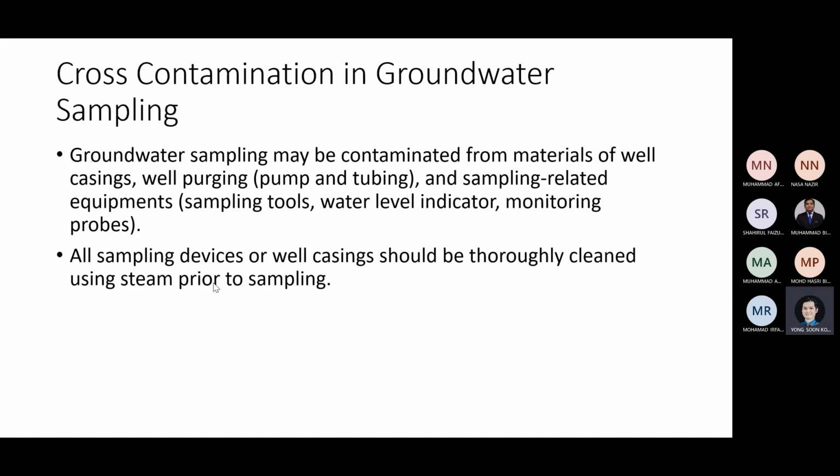Okay, so cross contamination may happen, like I said, in the tube and also the equipment itself. So always flush it properly before you collect those samples. And that is all.